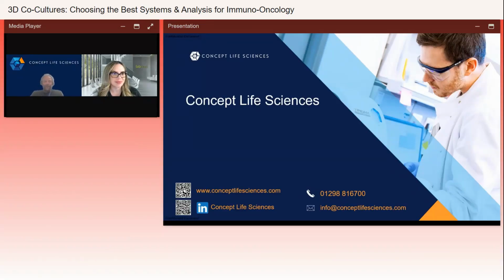This is a bit beyond my expertise. We are starting to get into that ourselves and trying to model, especially around the imaging. I say the things that I'm mostly interested in are the immune cell components, so I tend to want to find those. But I say we are using image analysis programs. So I know that Thermo have their Mira program, which works quite well alongside this to get those sorts of answers. And our histology guys here have got quite a lot of experience with doing image analysis and looking at how things are structured with each other. I'm not sure about the mathematical models, but I think it all comes down to how you do that image analysis in the first place.